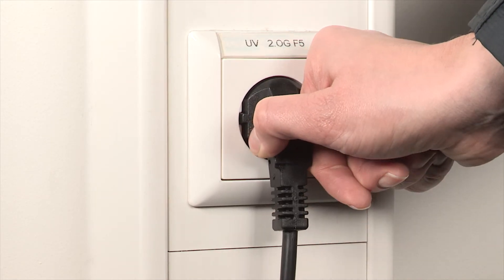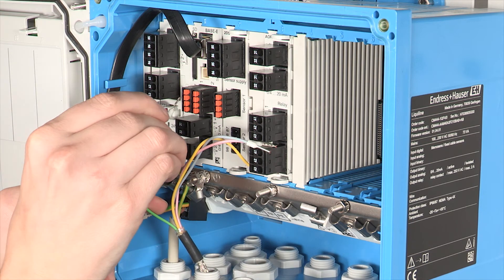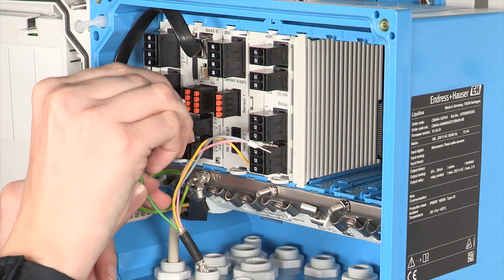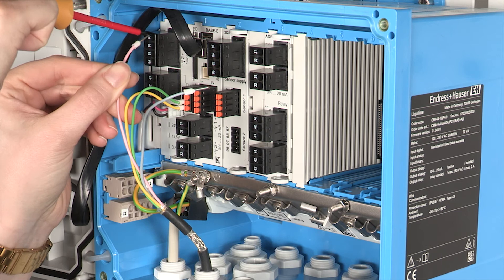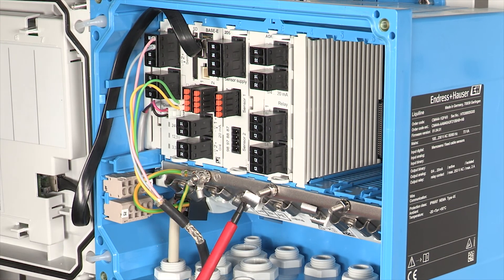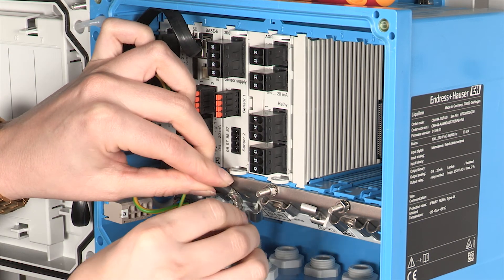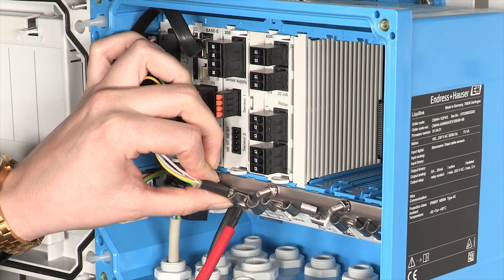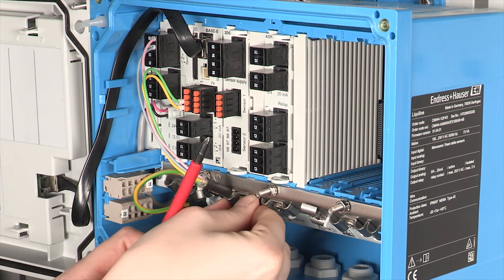Please ensure that no voltage is present on any cable before wiring the sensor. Thanks to the color-coded wires the connection is pretty easy. Make sure that the cable is grounded correctly.